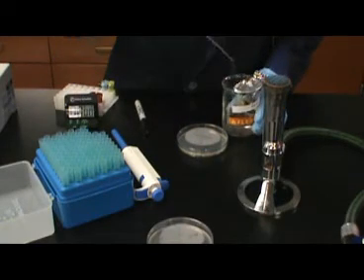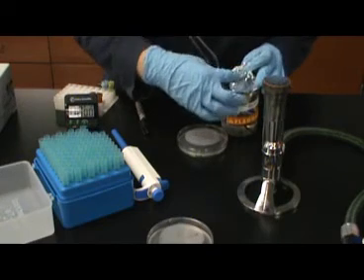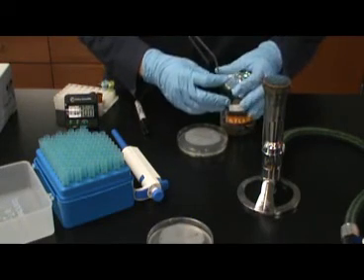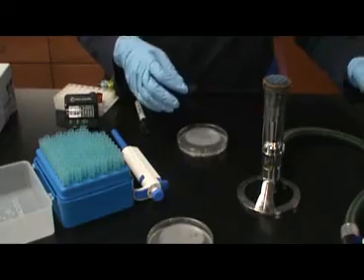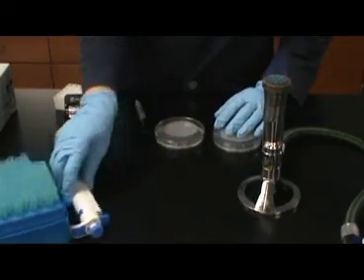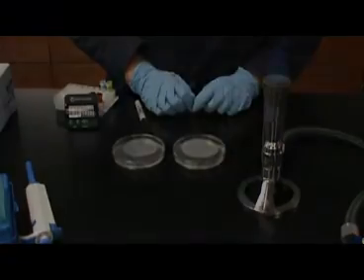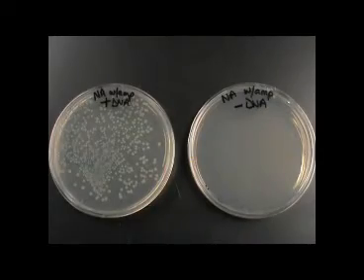Once inoculation is complete and the plates have been allowed to sit on the bench for 10 to 15 minutes, they should be placed into a 37 degrees Celsius incubator for 24 to 48 hours. We have found in our lab that 48 hours is the best amount of time to use for observable growth. Shown here is a nutrient agar with ampicillin plate with positive or transformed DNA on the left and the control on the right.